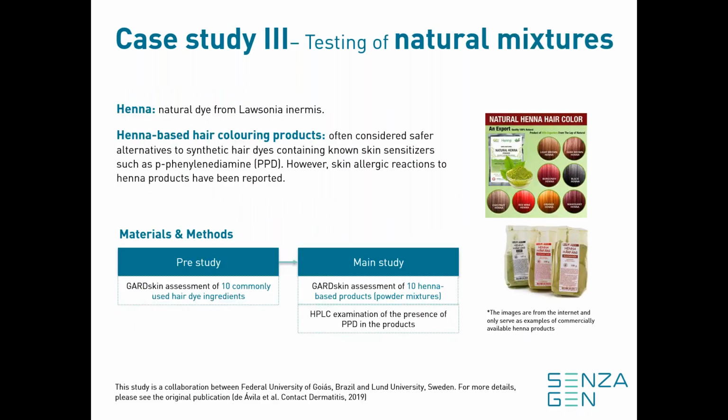So moving on to the next case, which describes the testing of natural mixtures. This specific project is a collaboration with the Federal University of Goiás in Brazil. And the aim of the study was basically to use a portfolio of different in vitro assays in order to predict the sensitizing properties of different henna-based hair coloring products.